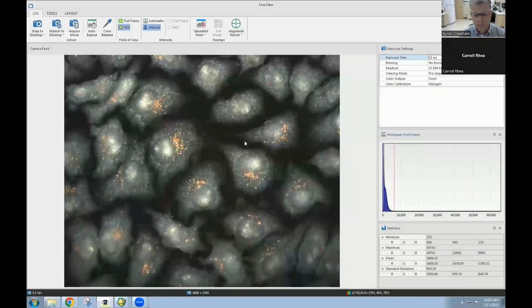And also, as it relates to fluorescence, there may be a need to try to fluorescently label cells in some cases to look at co-localized information of nanoparticles in cell structure that's fluorescent. And that's a fantastic application for the system. And we're going to show some examples of that a little bit later on that take that into account.